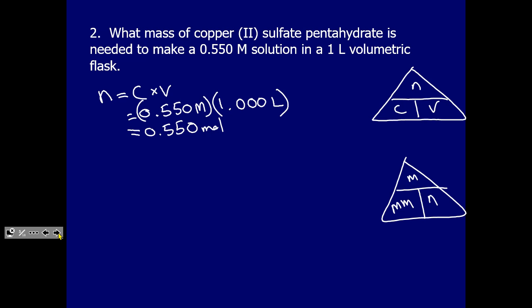Now, this brings us to the molar mass. CuSO4. Right? Now, we talked about hydrates. And copper 2 sulfate comes as a hydrate. I have some right here. This is for an experiment with my grade 9s tomorrow. This is copper 2 sulfate pentahydrate. It's blue. If it wasn't pentahydrate, if that water, that hydrate was gone, this would be gray. All right? We would say it was anhydrous, without water. But this is pentahydrate. So when I weigh this, the waters are in there.